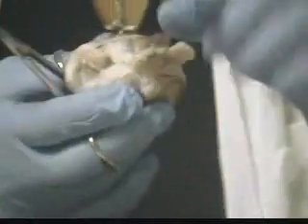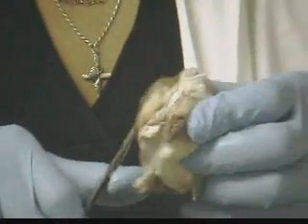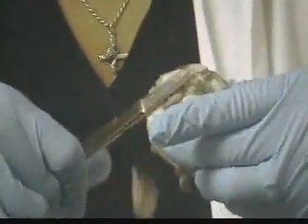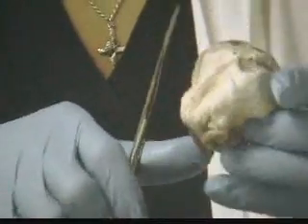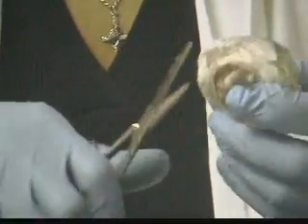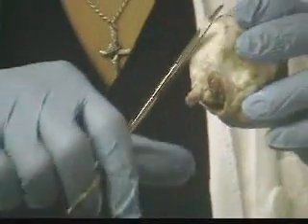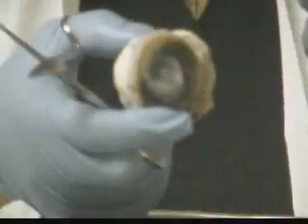The first thing we're going to do is remove what we call periorbital adipose — it's the same thing as fat. It actually cushions the eye in the eye socket. When we remove the periorbital adipose, the first tunic that we encounter is called the sclera. The sclera is also known as the white of the eye. The cornea is part of the sclera, except it's modified to allow light to enter the eye.